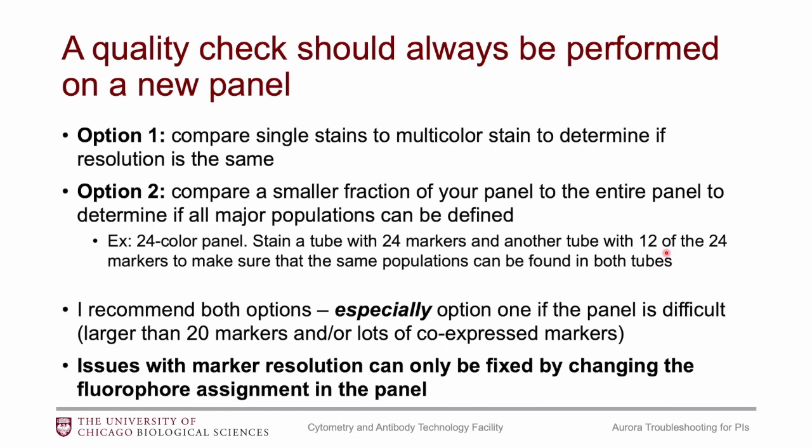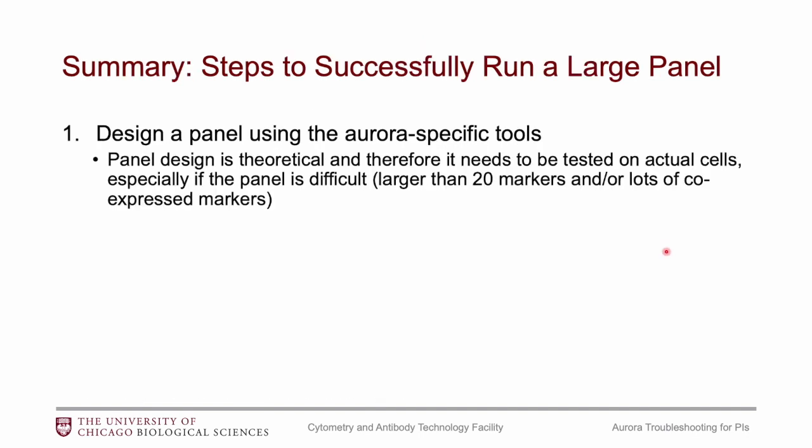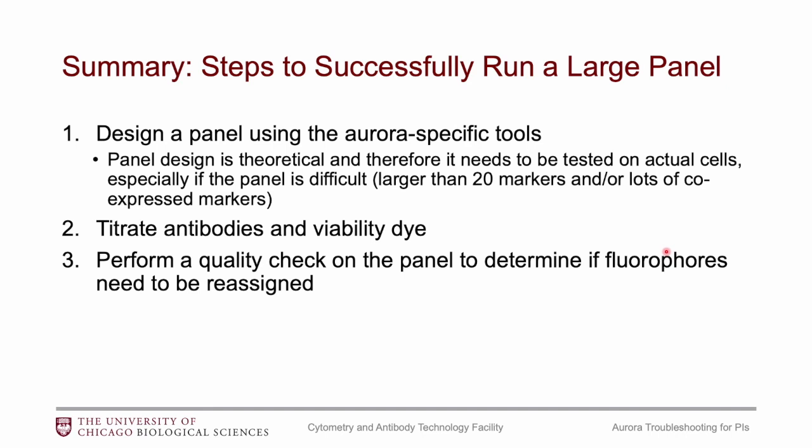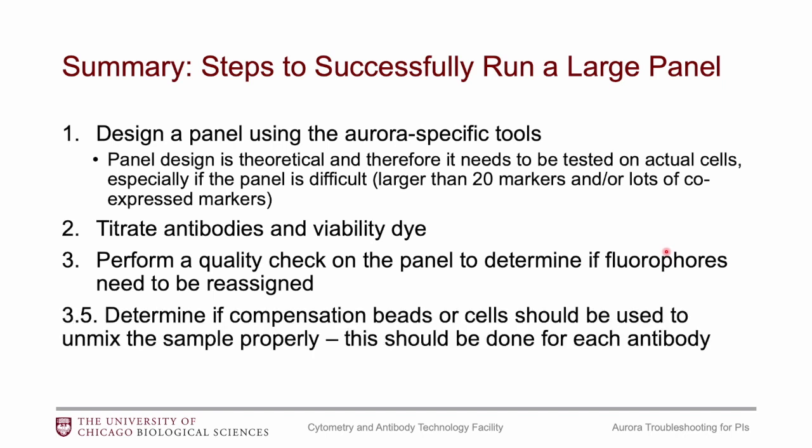If you find issues with the panel, the only way to fix them is to rearrange the panel. To summarize, the recommended steps for running a large panel are: first, design the panel using the Aurora-specific tools; second, titrate the antibodies and viability dye; third, perform a quality check to assess panel design; fourth, run the experiment comparing compensation beads and cells for reference controls to determine which to use; and finally, run your experiment.